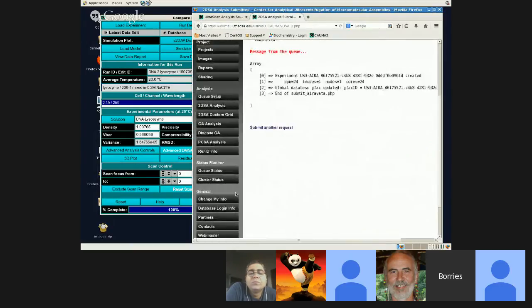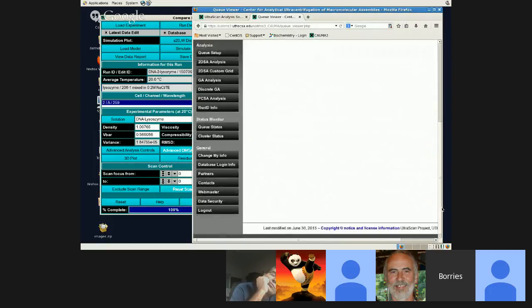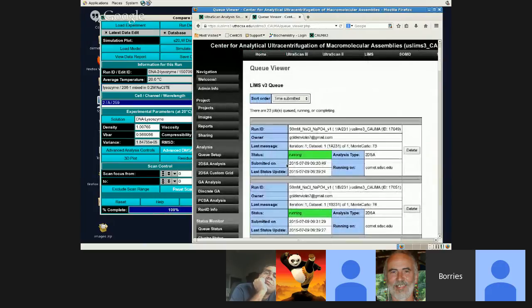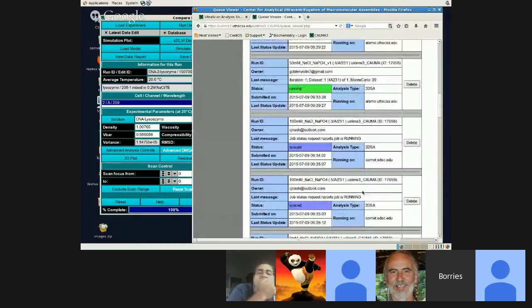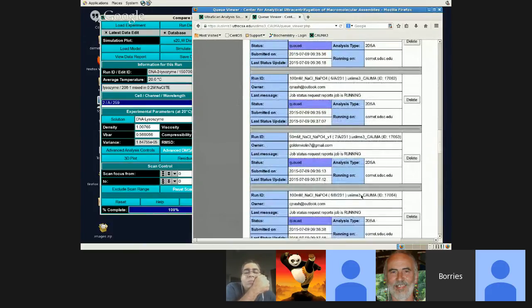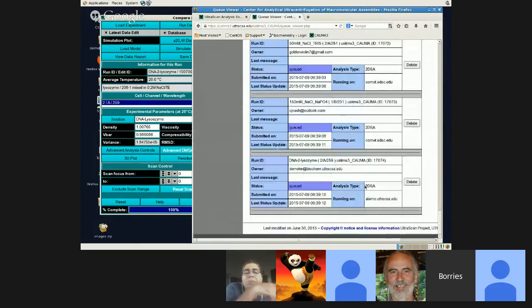And then we can follow along what happens when we go to Q status. And where's our job? Oh, this is way at the end here.